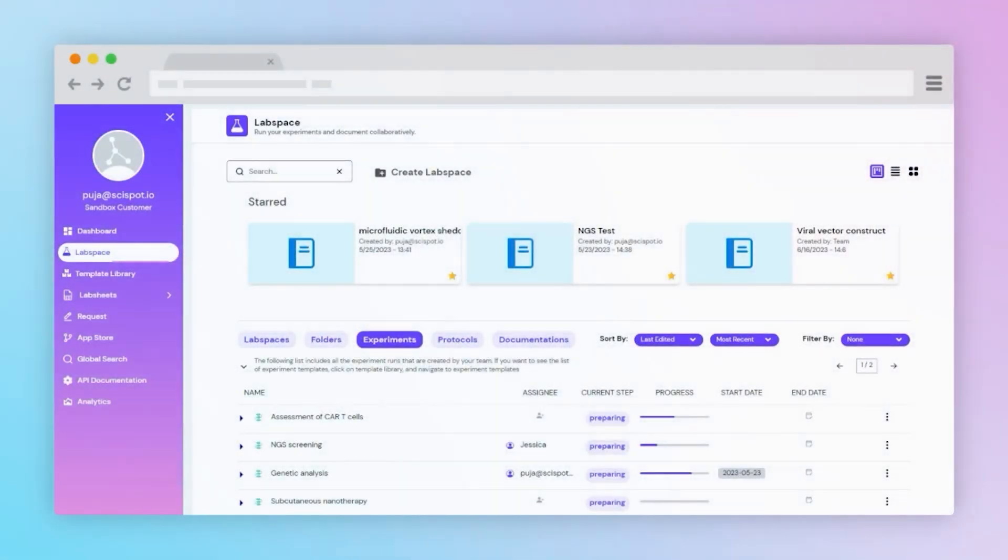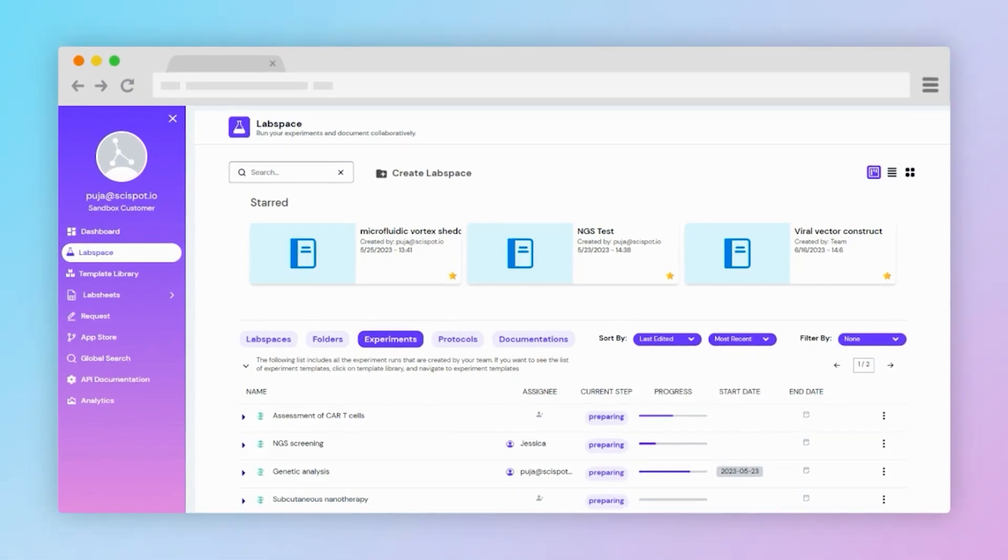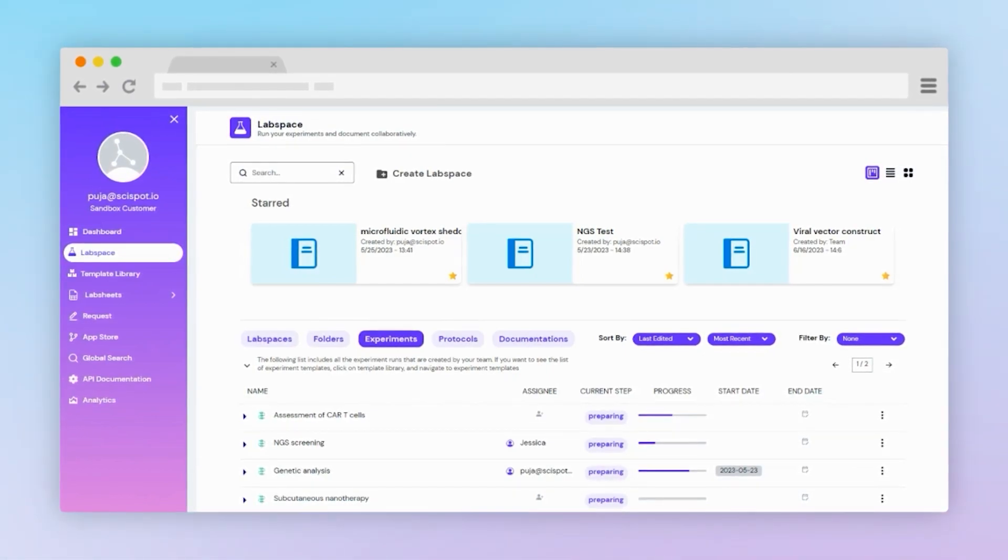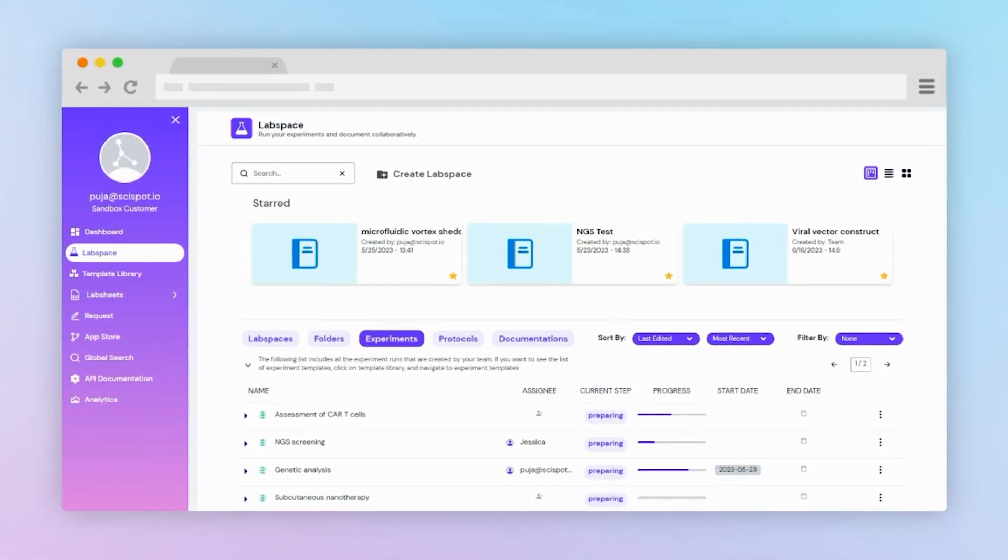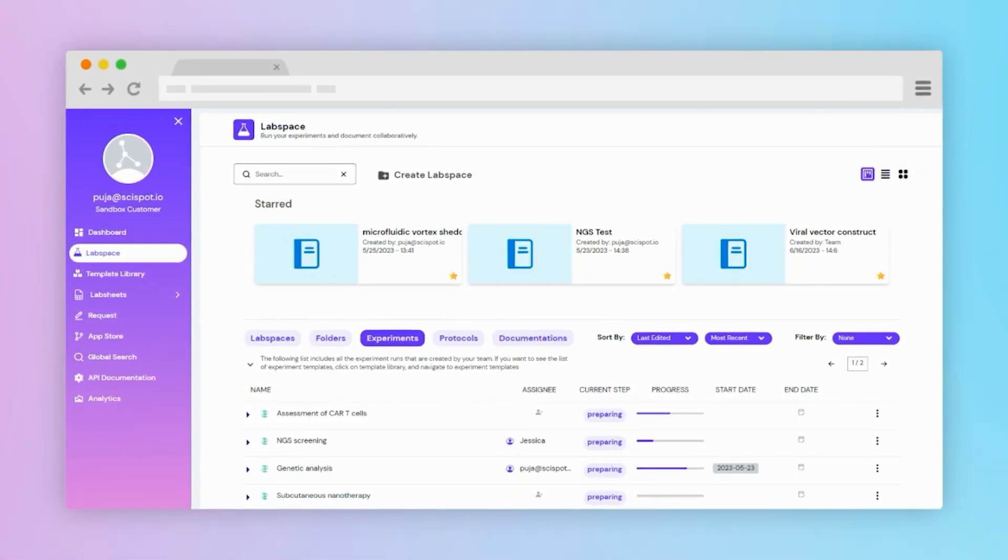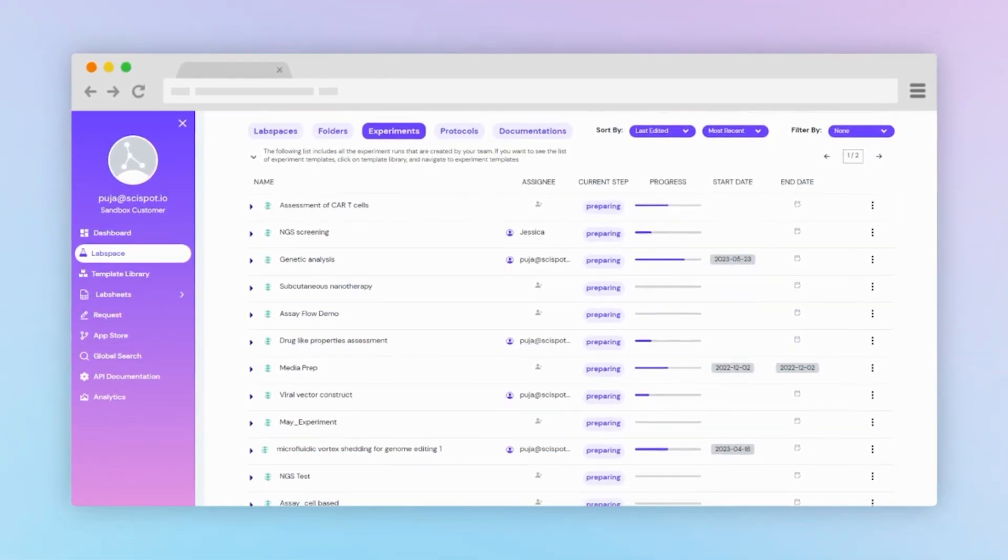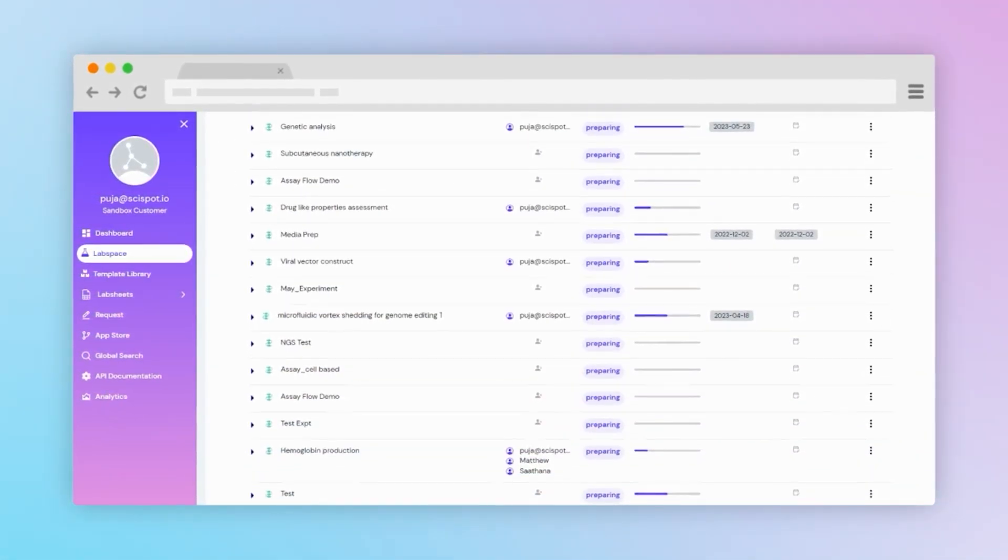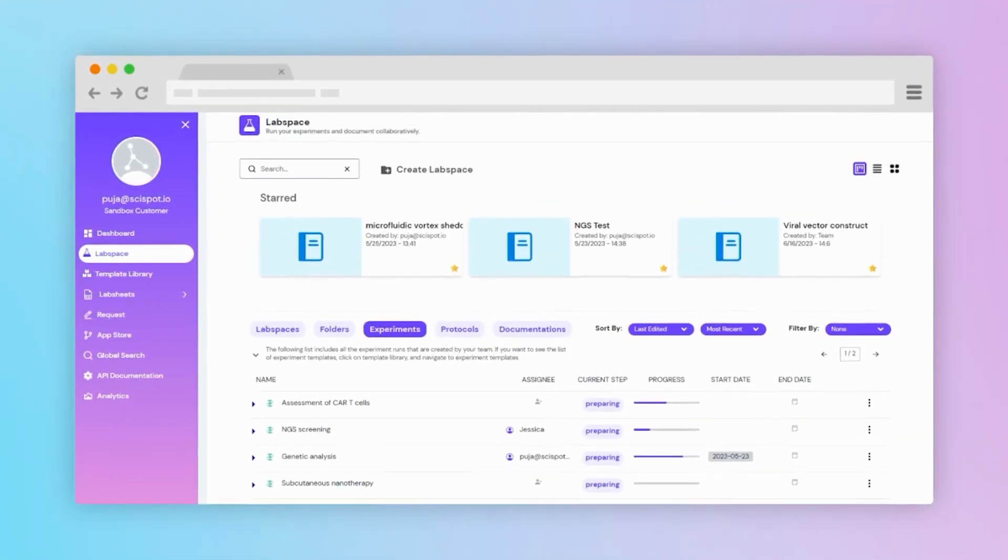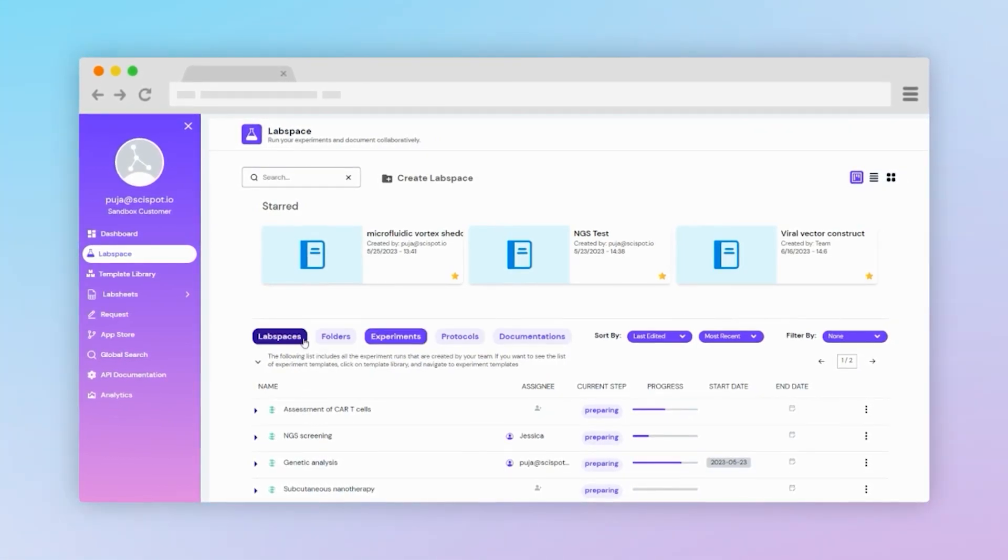Let's move on to LabSpaces. LabSpaces is a powerful collaborative tool supported by project management features. Users can track and trace progress, assign tasks to team members, and manage workflows.